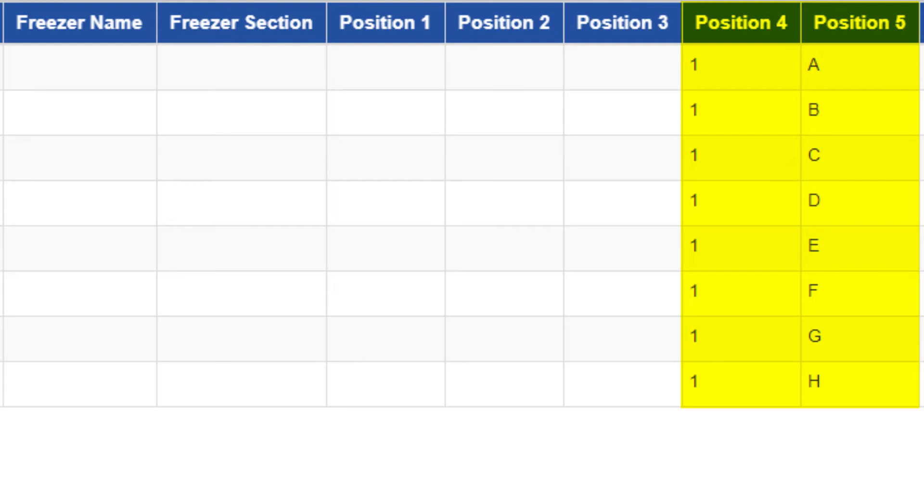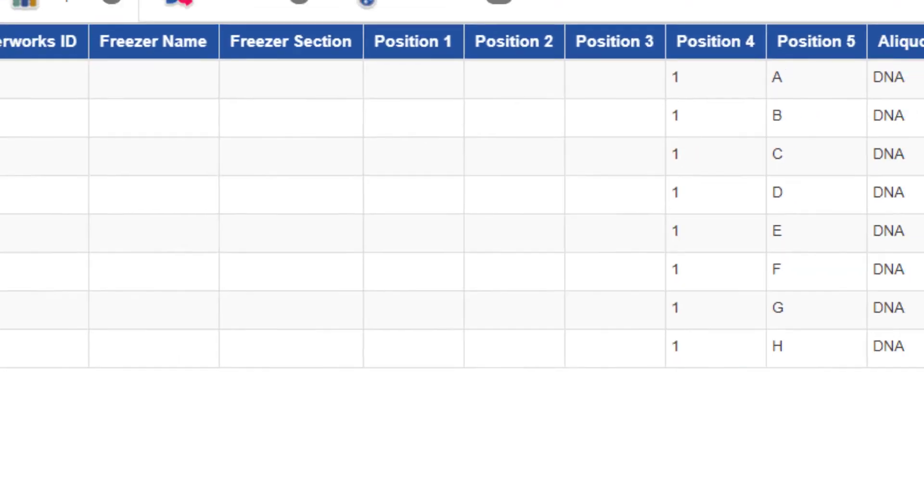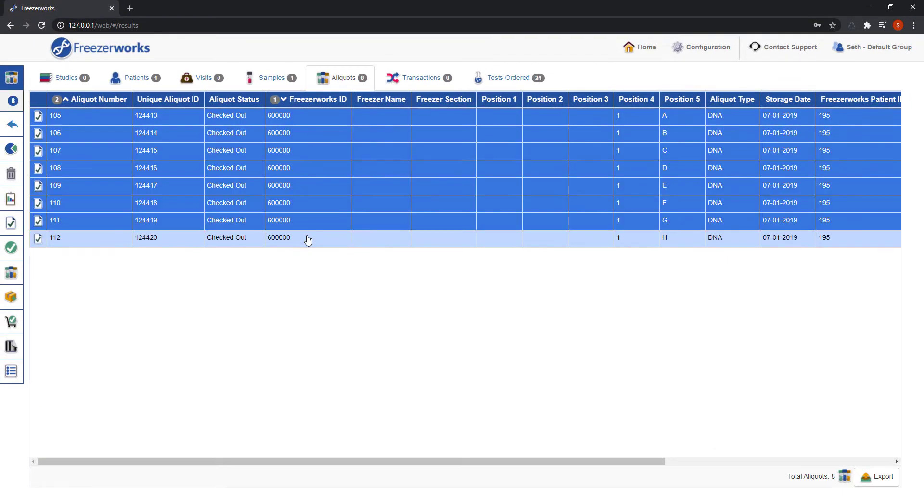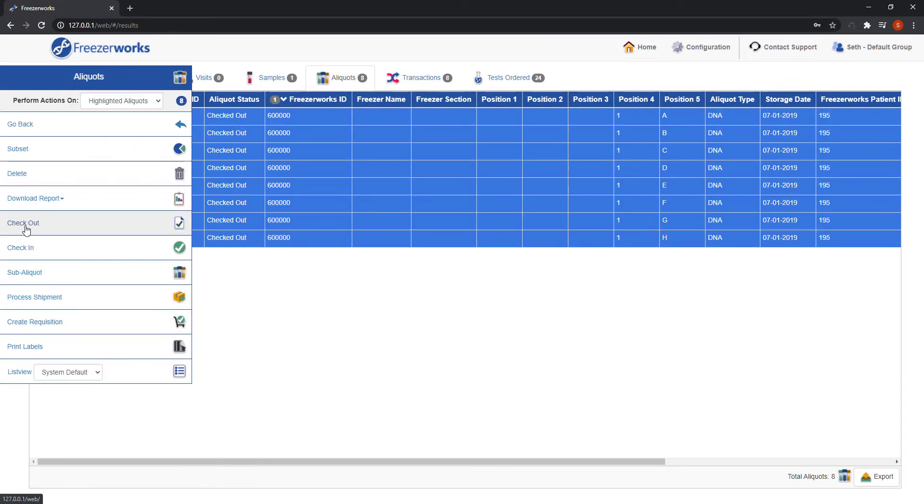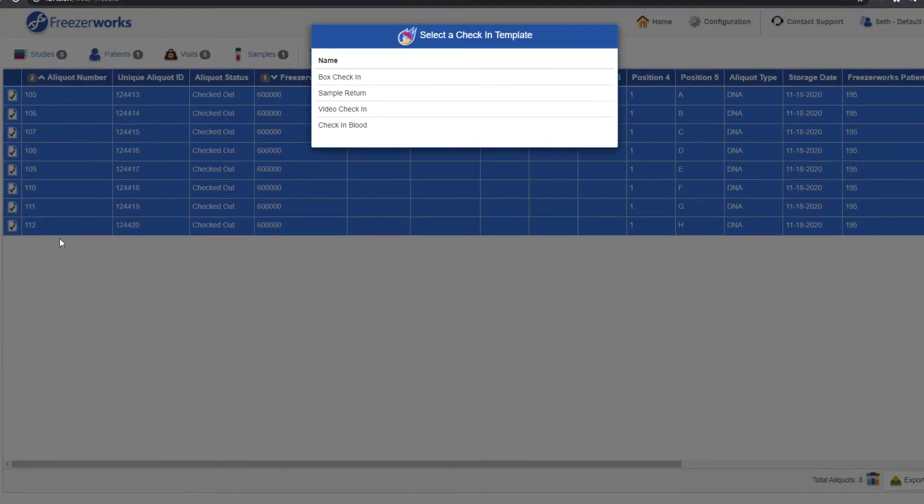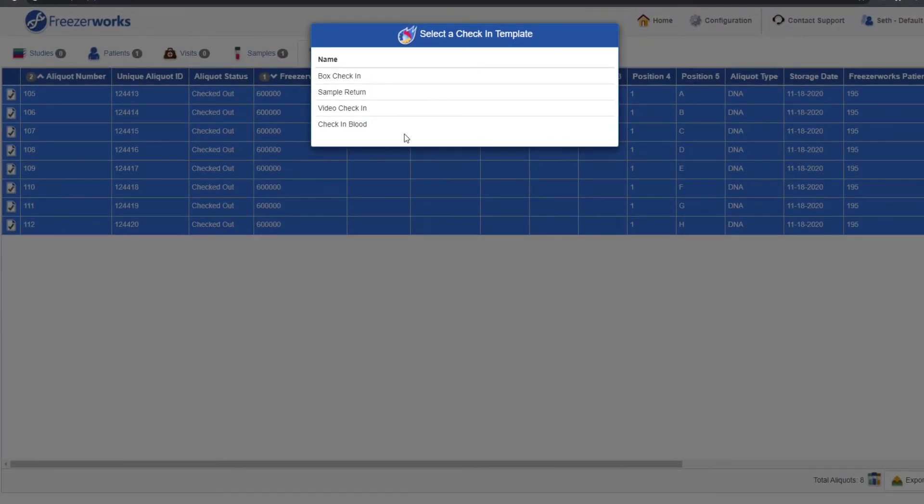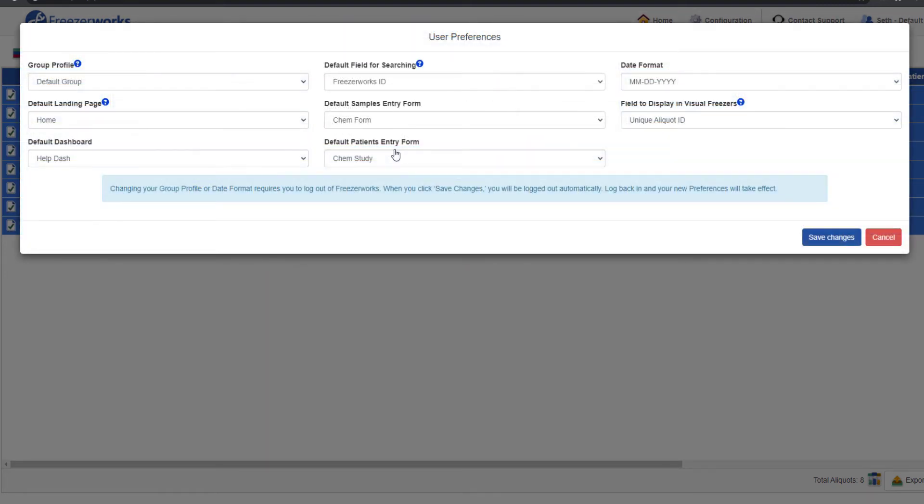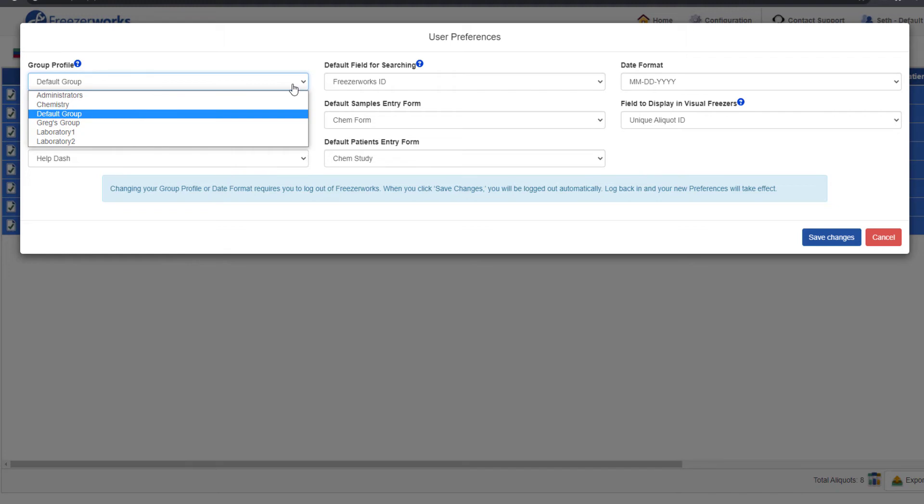When we check them back in, they will keep their final position values, even if we find a new freezer for them. Let's highlight them, hover over the actions menu, and select check-in this time. Pick the desired check-in workflow template from the list. Remember that if you don't see the template you need, check your group profile. Workflow availability is based on group membership.